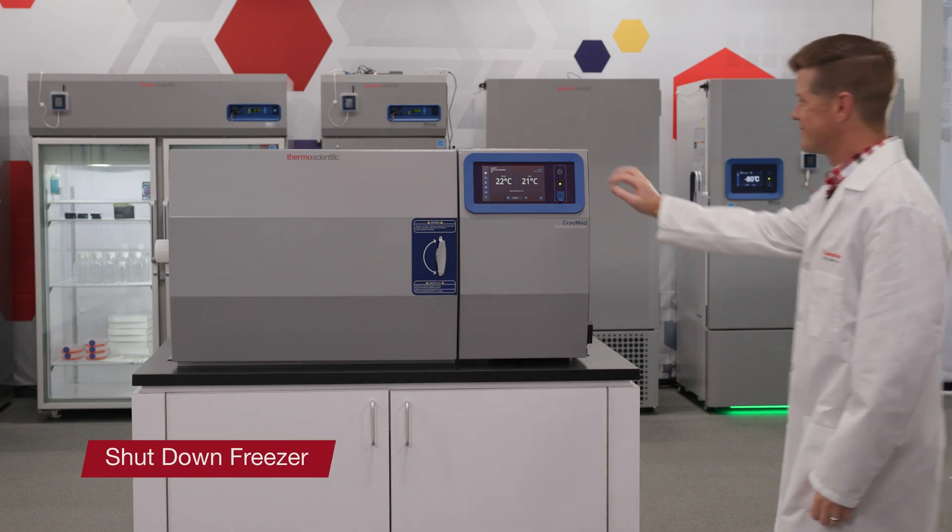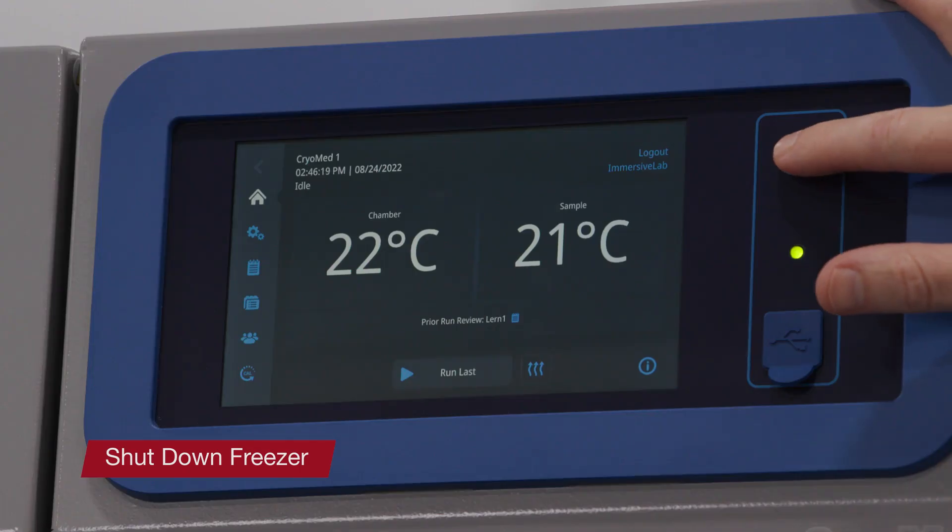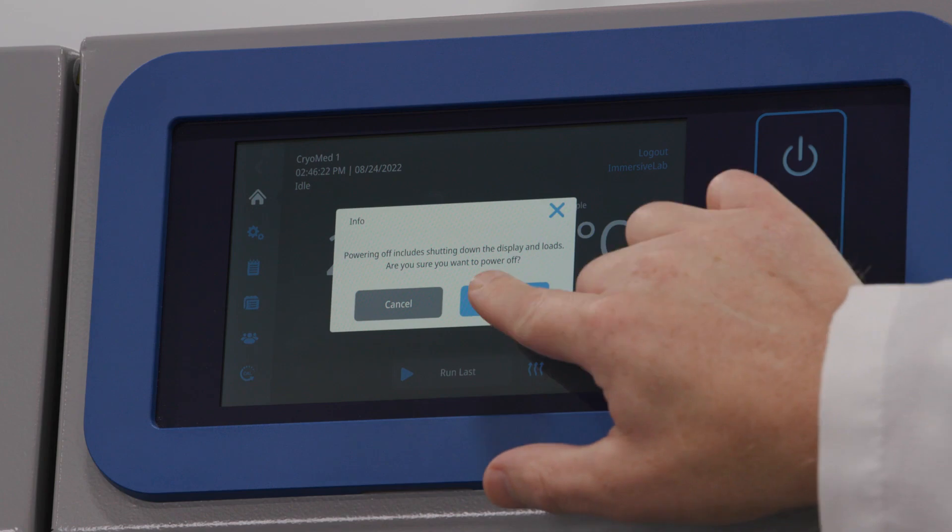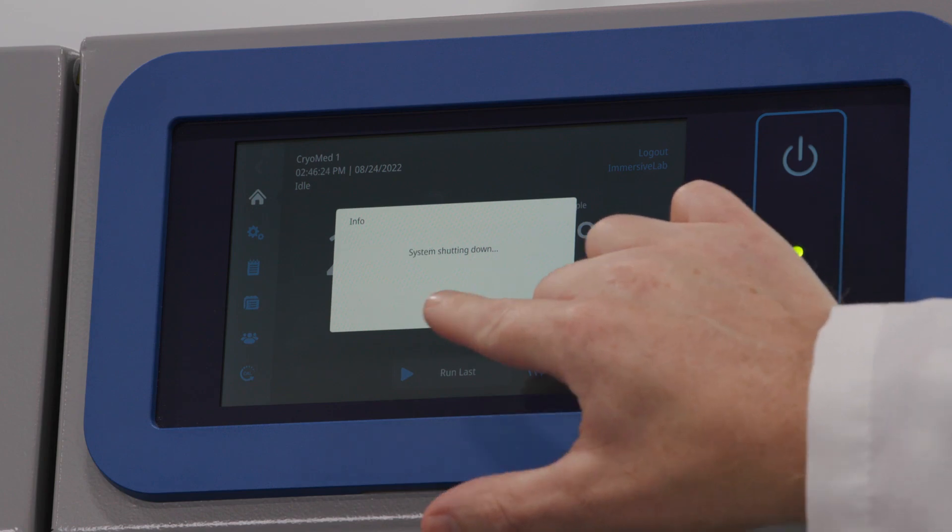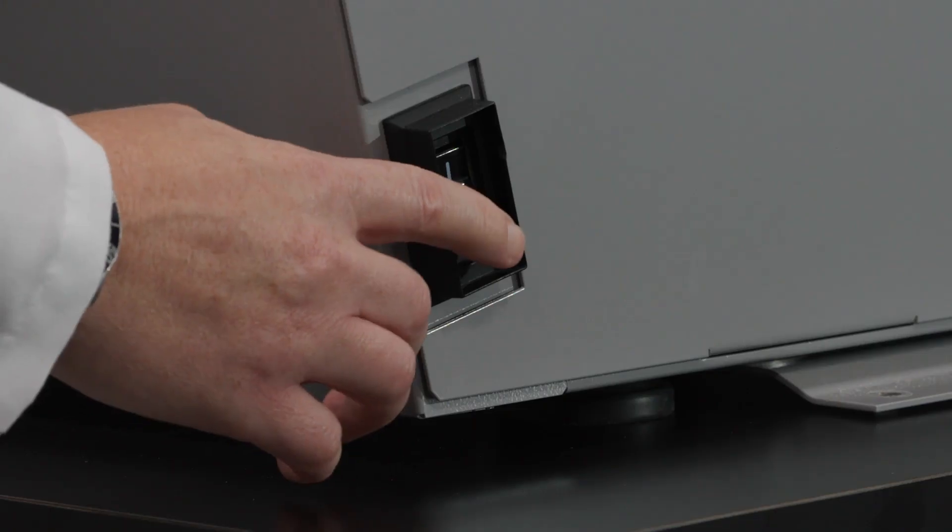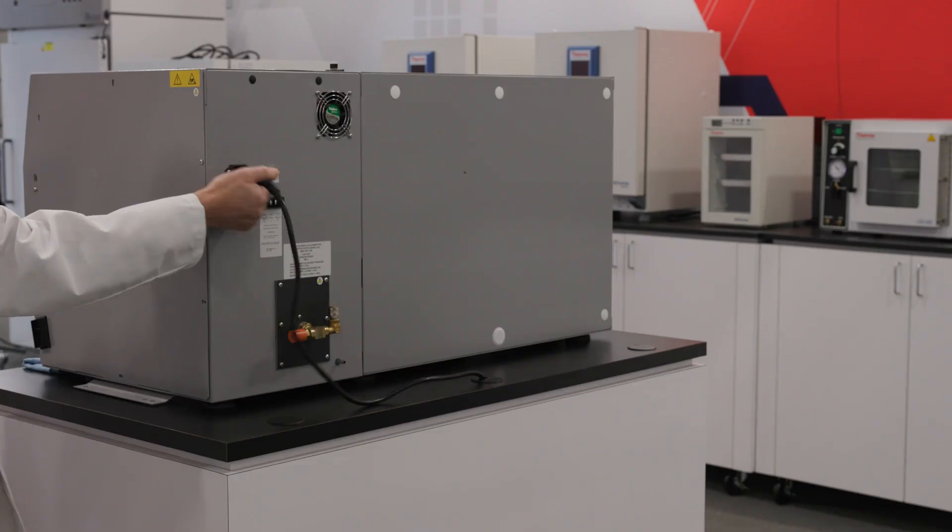Before beginning any of the maintenance requirements that we will go over, shut down the freezer using the shutdown button. Turn the freezer off and disconnect the plug from the power source before beginning any service work.